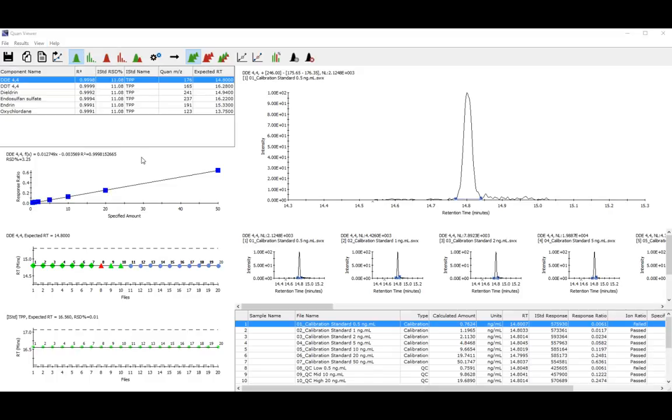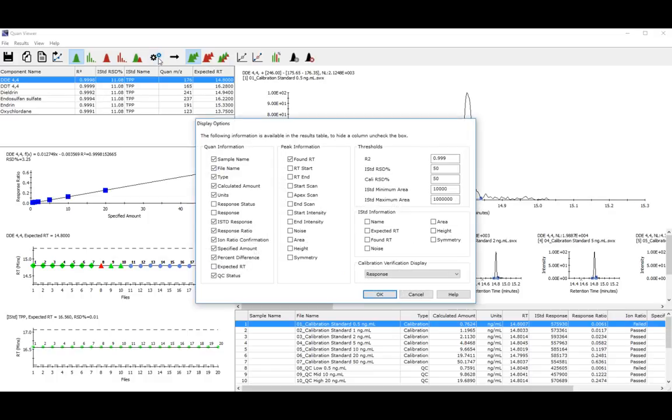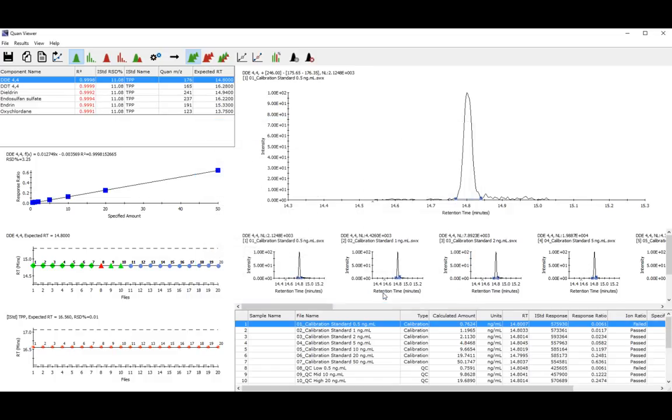You can set your display options in Quan Viewer by clicking the Options button and selecting or deselecting any of these parameters. You can also set thresholds for your data. If we update these and click OK, you can see that the data not meeting the thresholds you've set is now displayed in red.